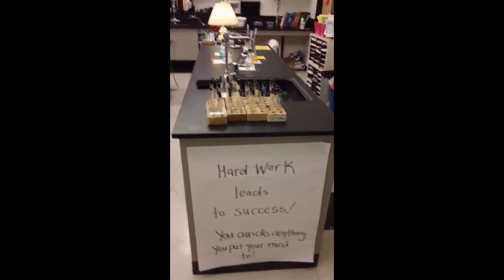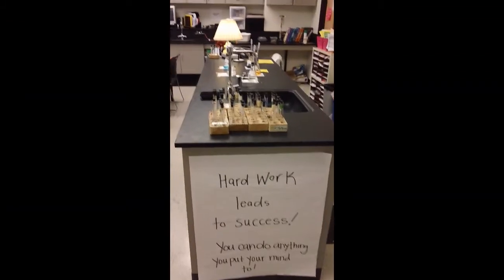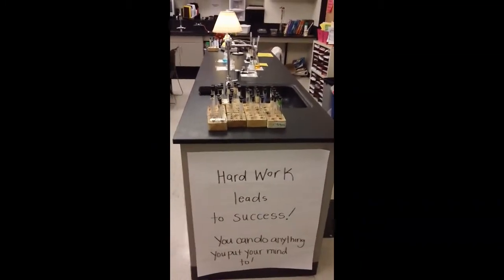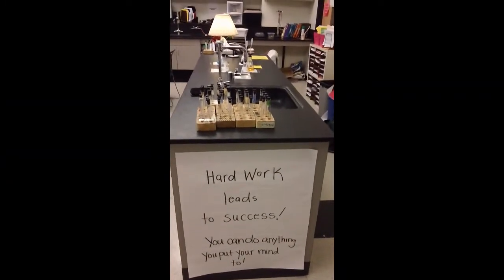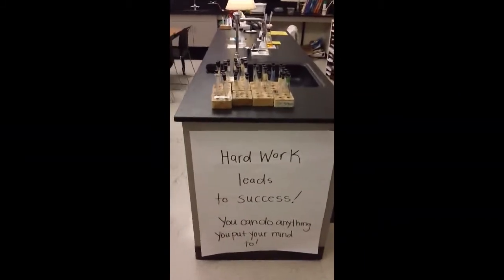Hello, sorry you missed our lab. I'm gonna videotape some of it so that you can see and be able to do your lab write-up in conclusion just by watching this video. So I'm gonna walk you through each of the steps and each of the parts of all of our tests, starting with having our blocks here.